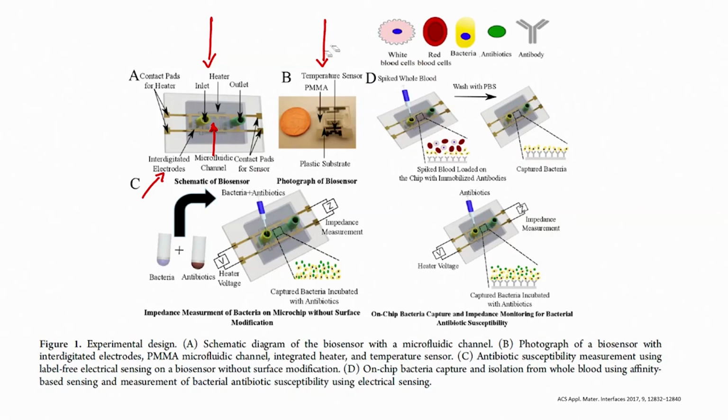Next step, what is the next step? Once the bacteria are captured, you load antibiotics with growth media.